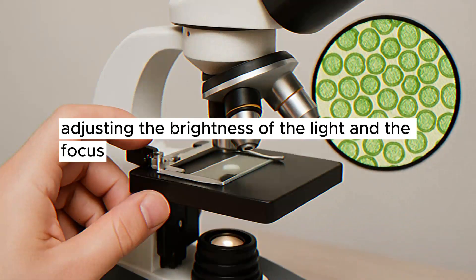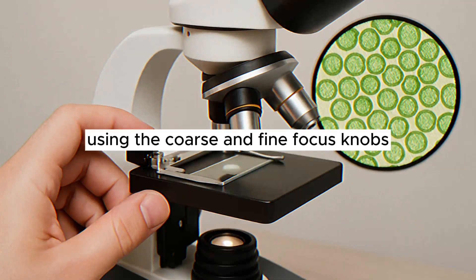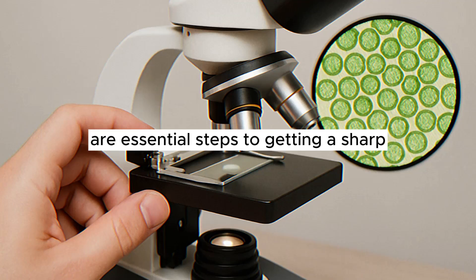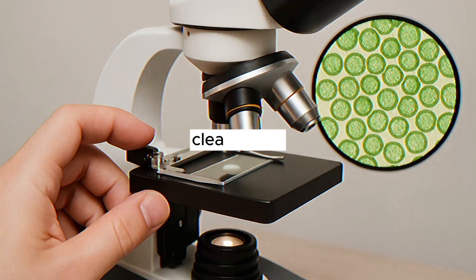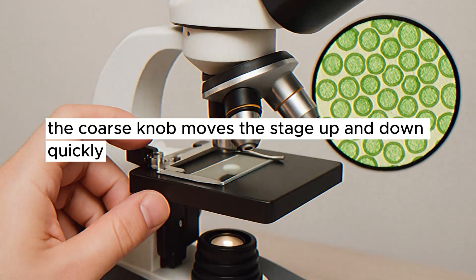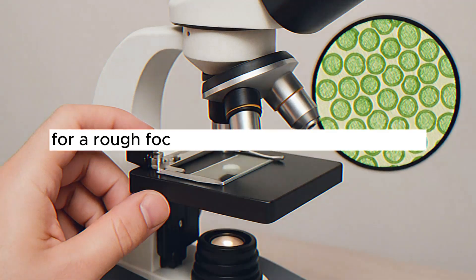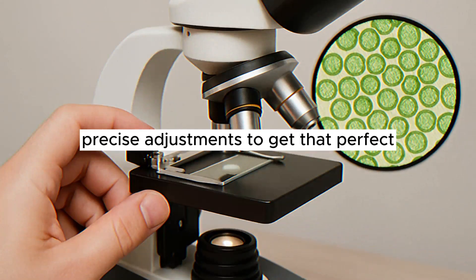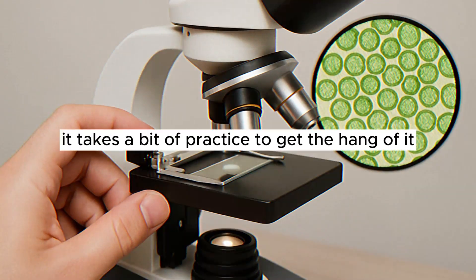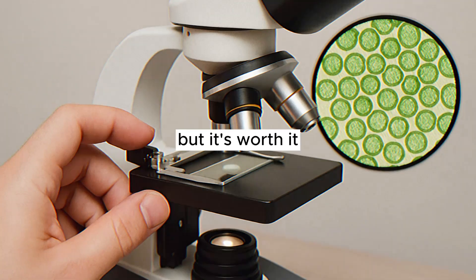Adjusting the brightness of the light and the focus using the coarse and fine focus knobs are essential steps to getting a sharp, clear image. The coarse knob moves the stage up and down quickly for a rough focus, and the fine knob makes tiny, precise adjustments to get that perfect crisp view. It takes a bit of practice to get the hang of it, but it's worth it.